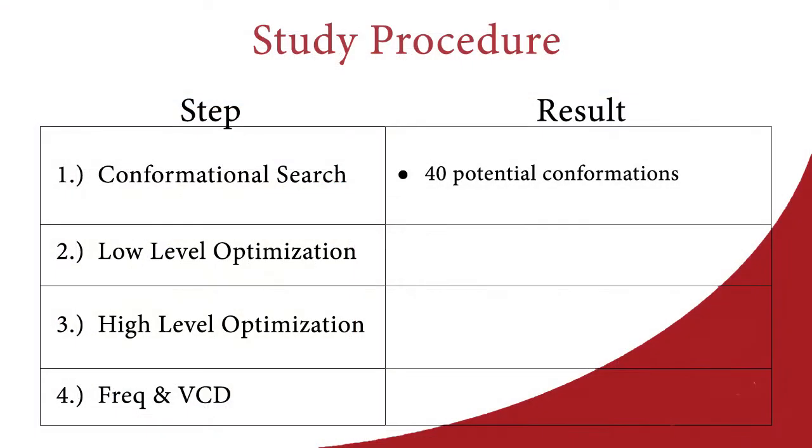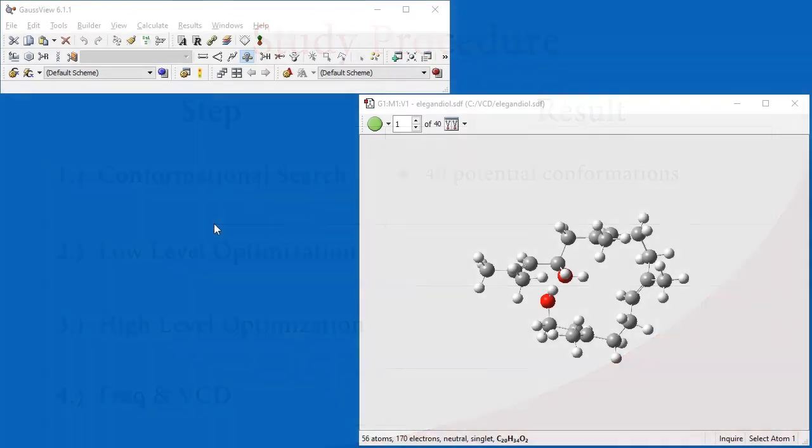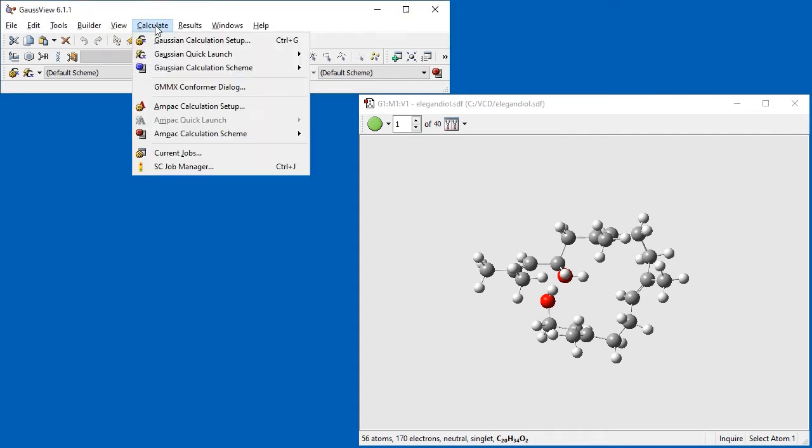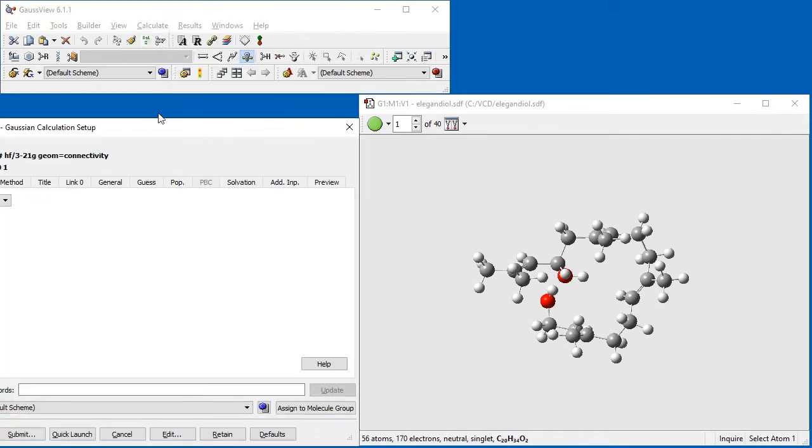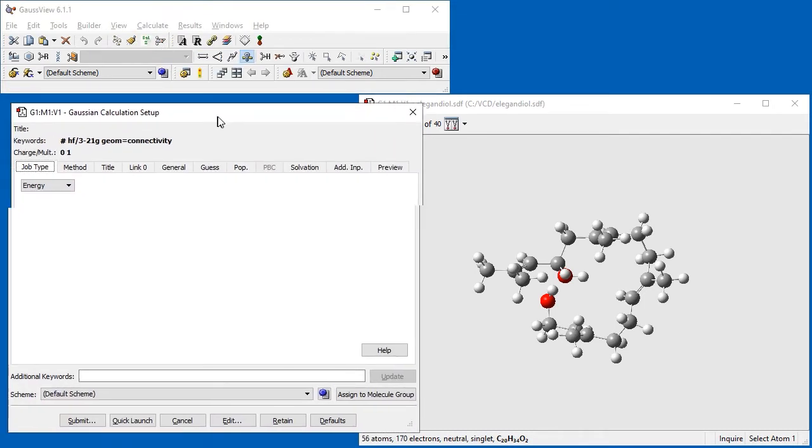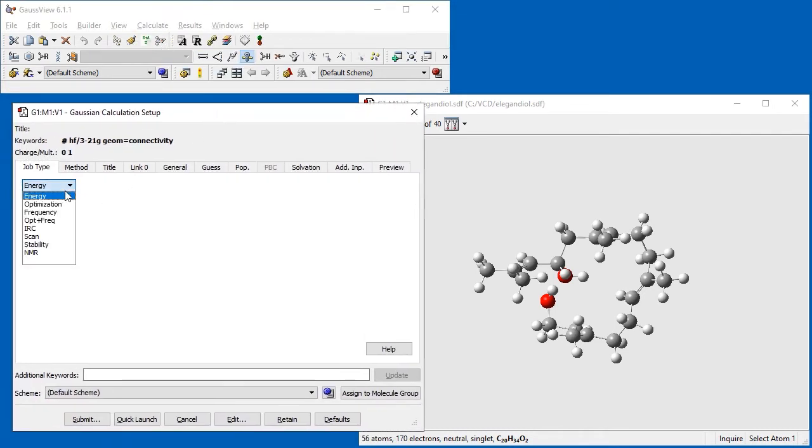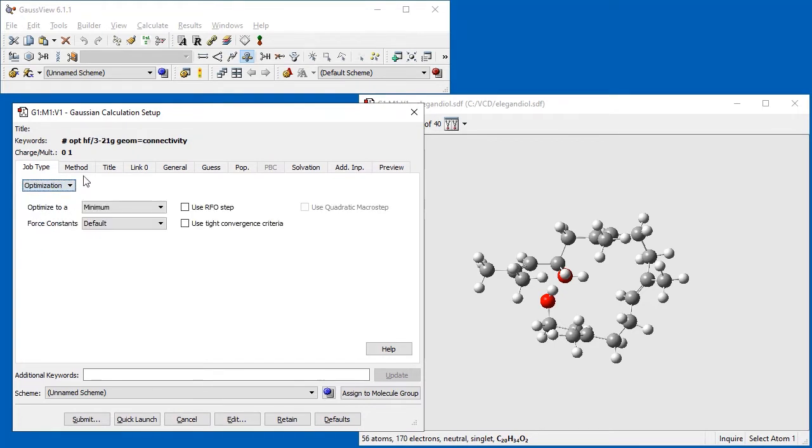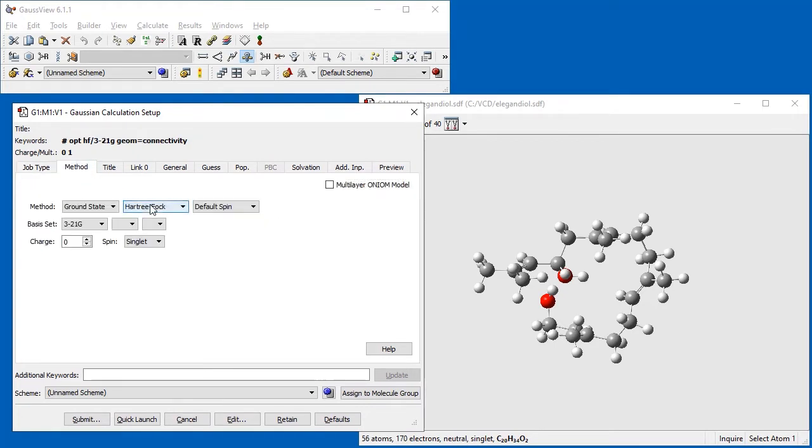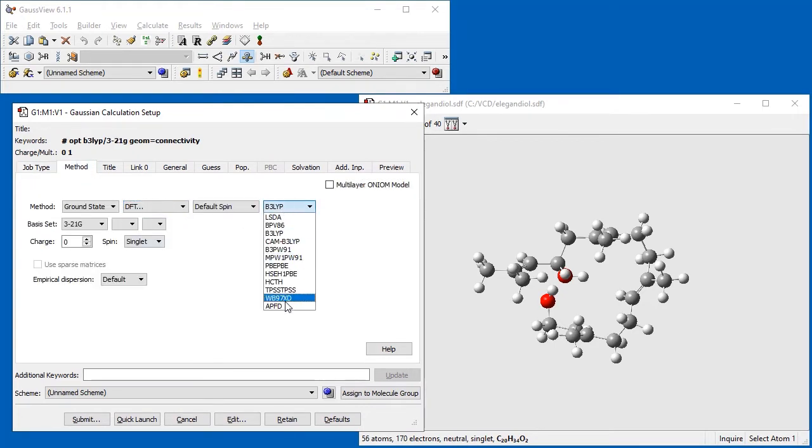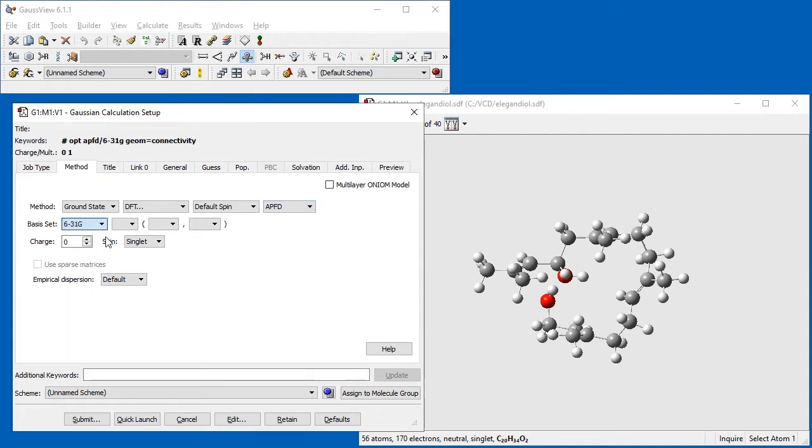This table shows our results so far. We will now perform a low-level optimization on each conformation. We navigate to the Gaussian Calculations Setup dialog and specify Optimization as the job type. We will use the APFD DFT functional with the 6-31G(d) basis set.